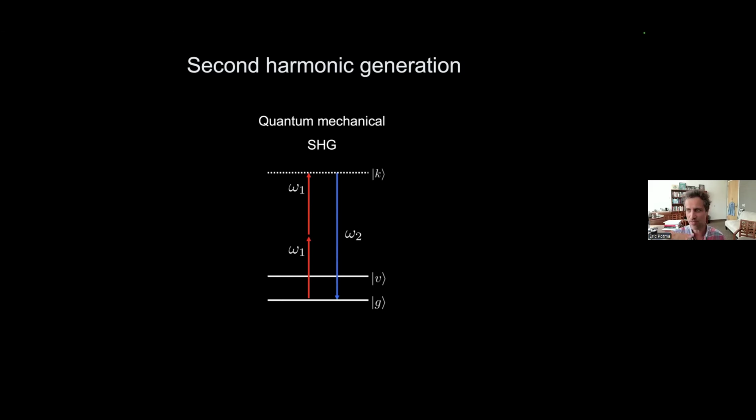It has levels, states of the molecule, and it also has arrows, and those are, of course, the photons. So you see the energy of the photon in relation to the energetic states of the molecule here. This lowest one is the ground state of the molecule. You see here another state called V, that is a vibrational level of the molecule. So these levels correspond to ground state vibrational modes of the molecule.